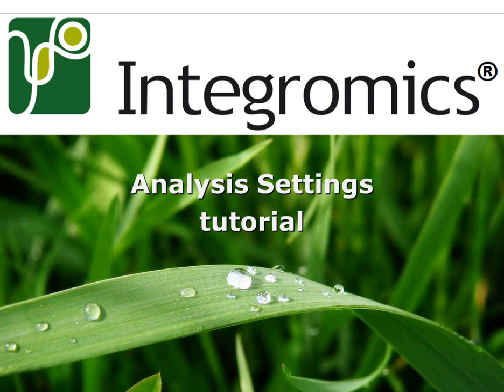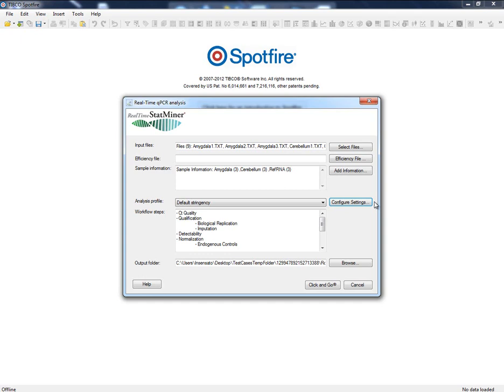In previous tutorials, we learned how to load our qPCR data into the application and define the experimental conditions of our analysis. Now it is time to get familiar with the settings of the analysis, and this tutorial teaches us how to configure any setting of the application from the Analysis Profile tool and how these configurations affect the analysis.